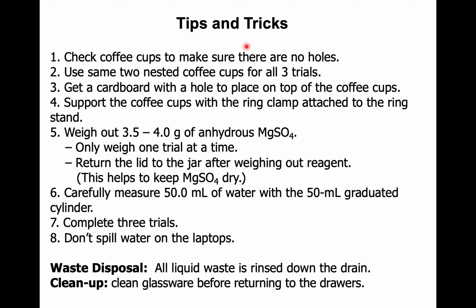So here are the tips and tricks. Check the coffee cups to make sure there's no holes. Even as people stir these, sometimes they'll poke a hole in the bottom. You want to make sure you don't have holes or any cracks in the bottom, because you'll start to lose solution. You want to use the same two nested coffee cups for all three trials for consistency.